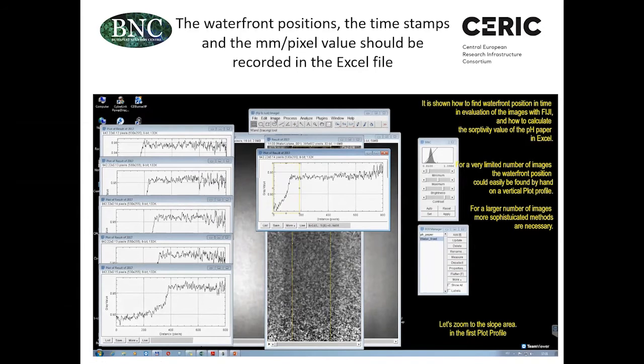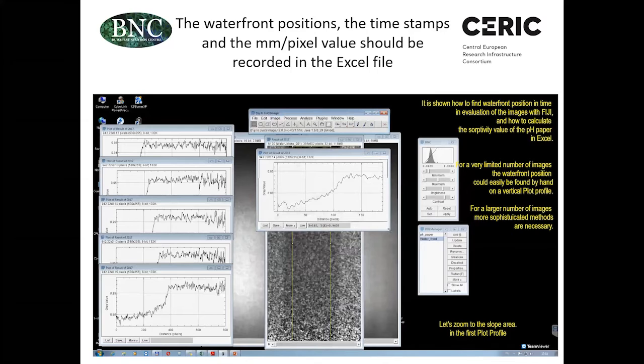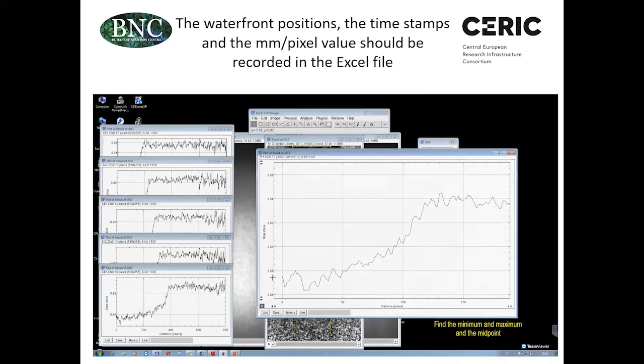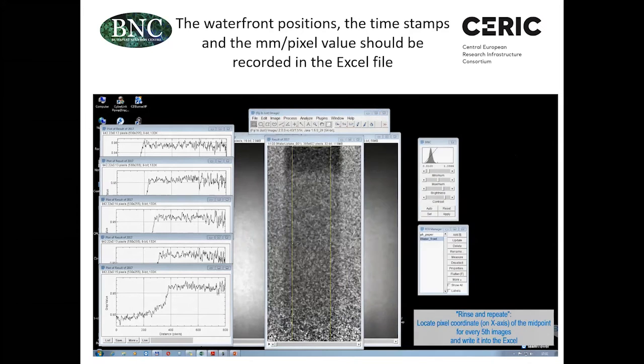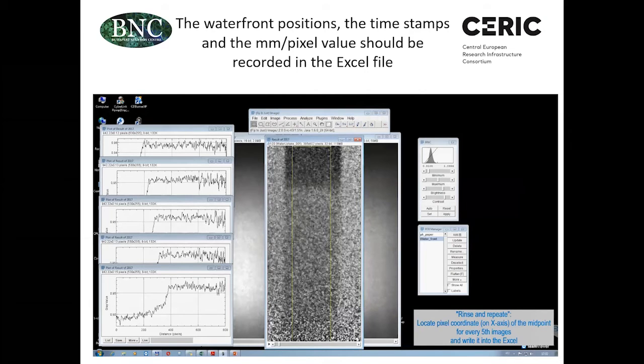So you can always zoom into relevant regions of your plots, and see the low level and the high level, and then you can find the middle point, and you can locate its position. And then for each frame which we evaluate, we put the pixel position into this table, and we will repeat it for every fifth frame.